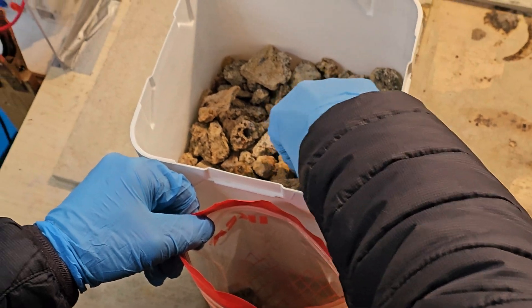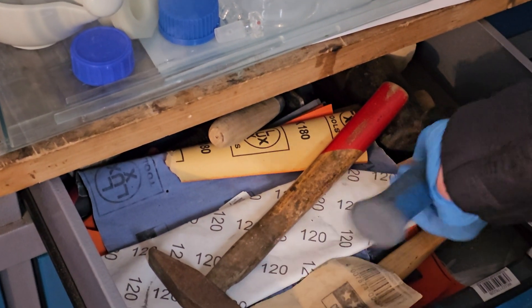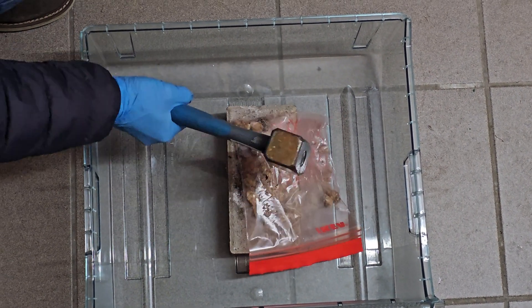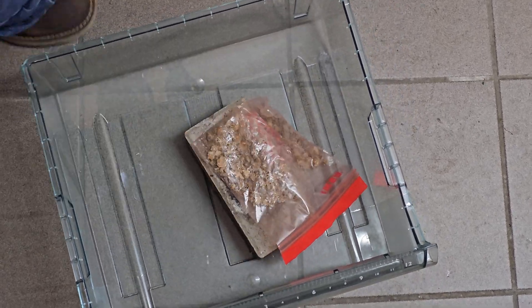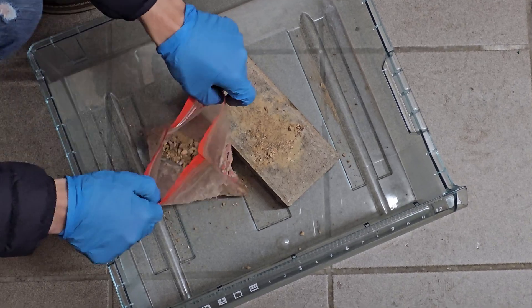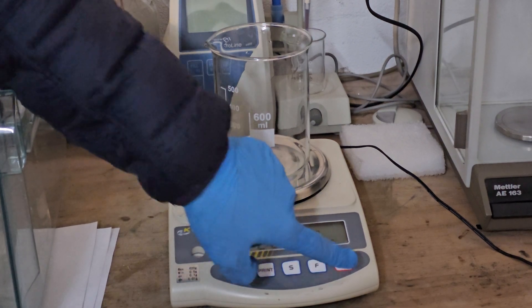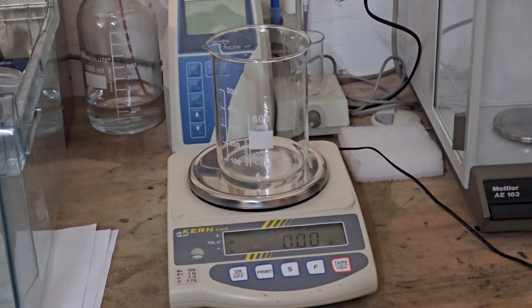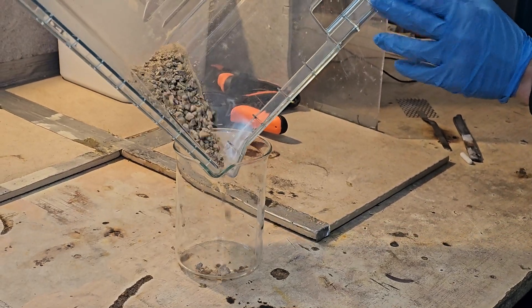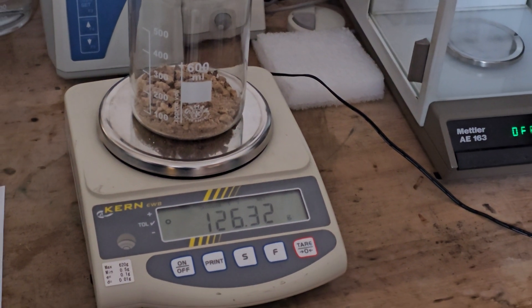Next we picked out a few samples from our collection, crushing them to enhance the surface area for the ore reaction. The sample weighed in at 126.32g.